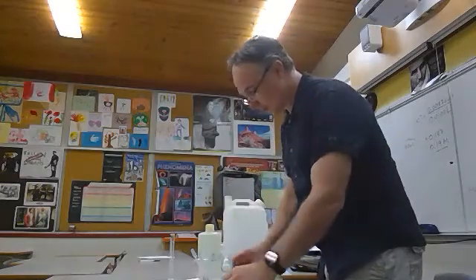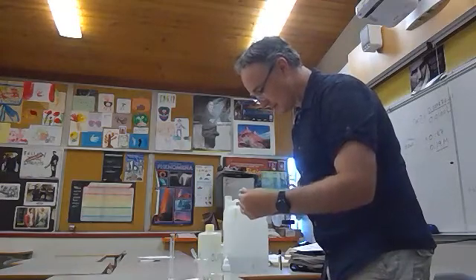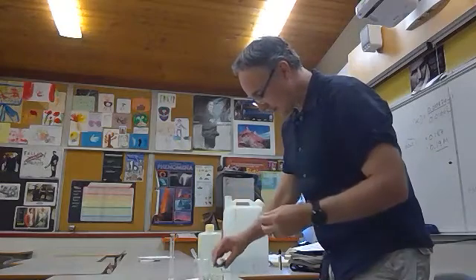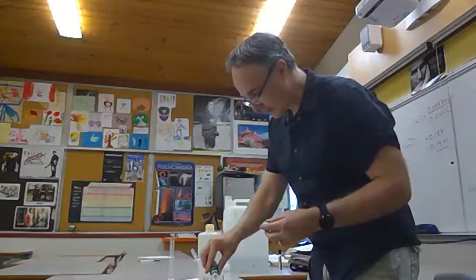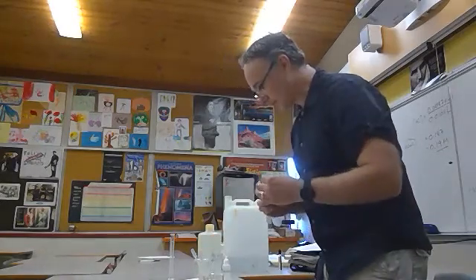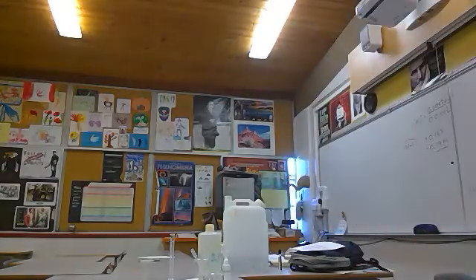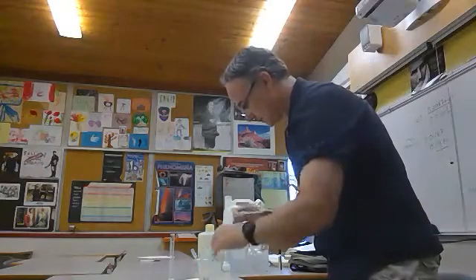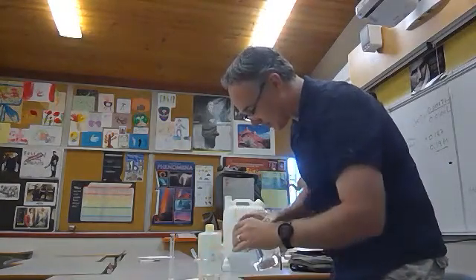So what I'm going to do is add that to an empty beaker, just a few drops of bromothymol blue. It's kind of a greeny color right now. Then I'm going to add just a little bit of water to that. We know water should be around pH 7 roughly. It depends on the temperature of the water, but it's close to pH 7. So I might need to add a bit more chemical. It's hard to see that.